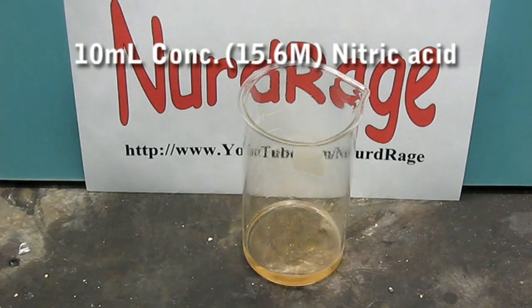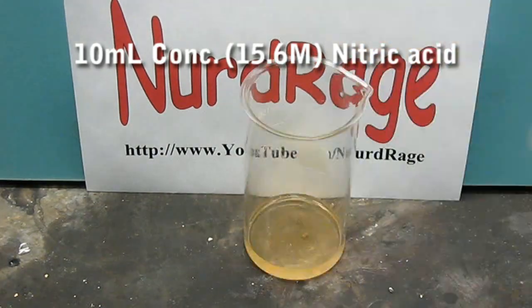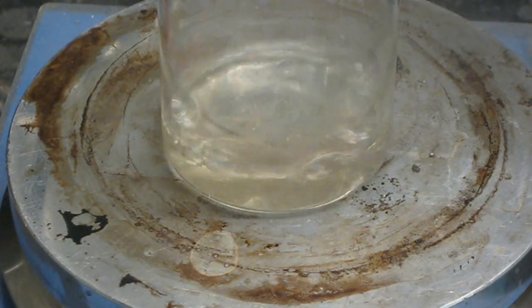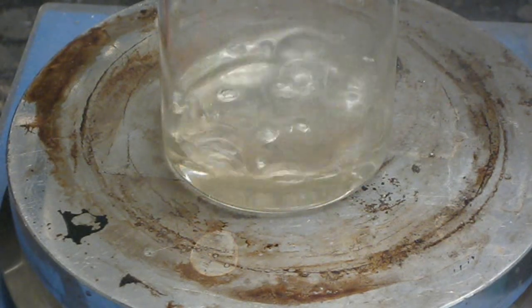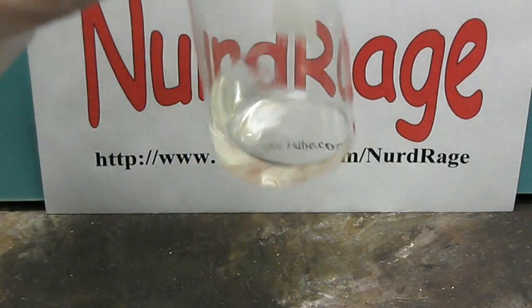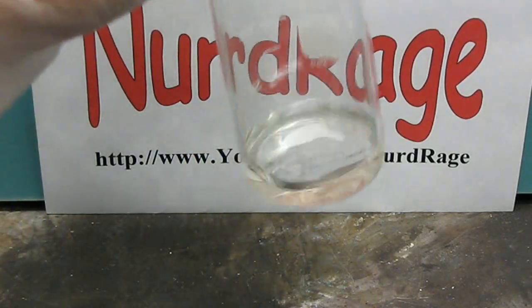Let the mixture react until it's just bits of dust left over. Now carefully heat the mixture until it boils and completely dissolves the metal. Now we have a pure solution of europium nitrate with excess nitric acid. We'll make this into a powder in a moment.